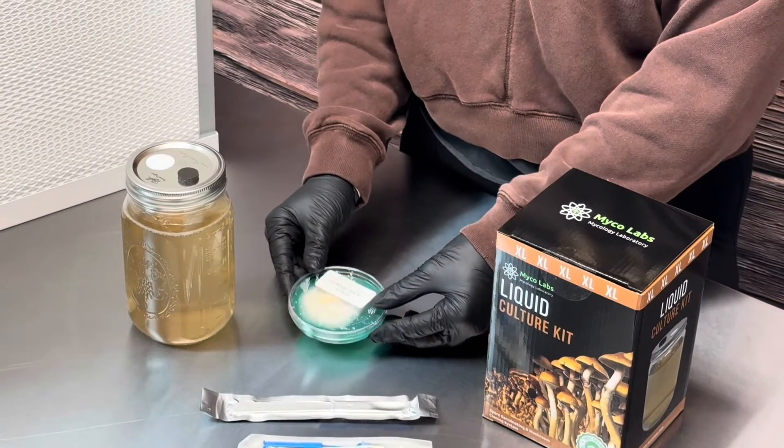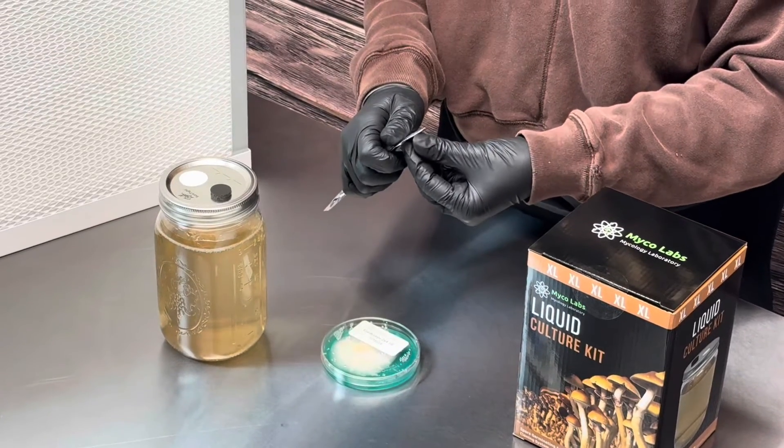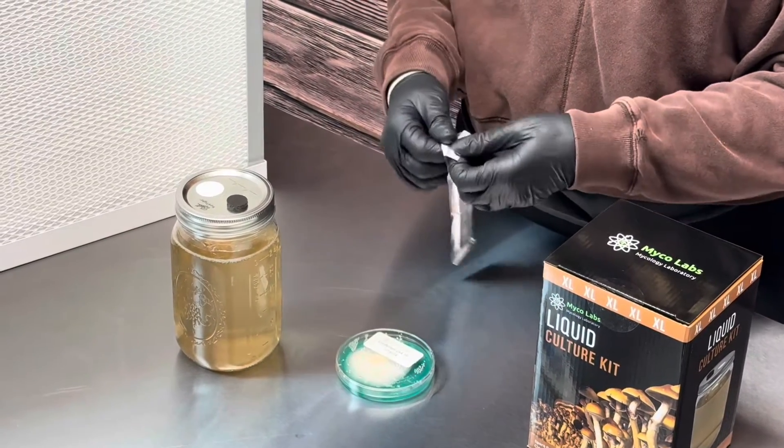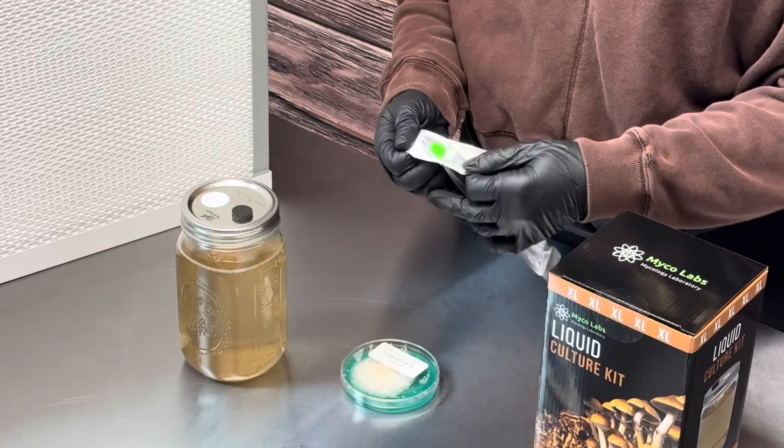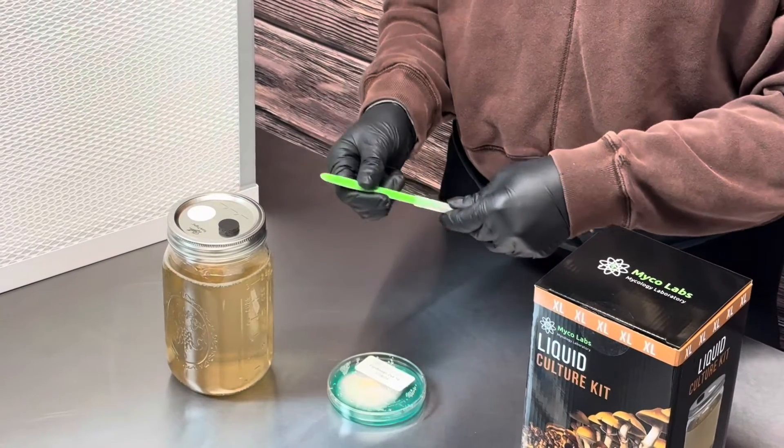Now we're going to take an agar plate that has cordyceps on it and use a scalpel to cut a little triangle off of it, then add that to our liquid culture so that later we can make liquid syringes with our cordyceps.